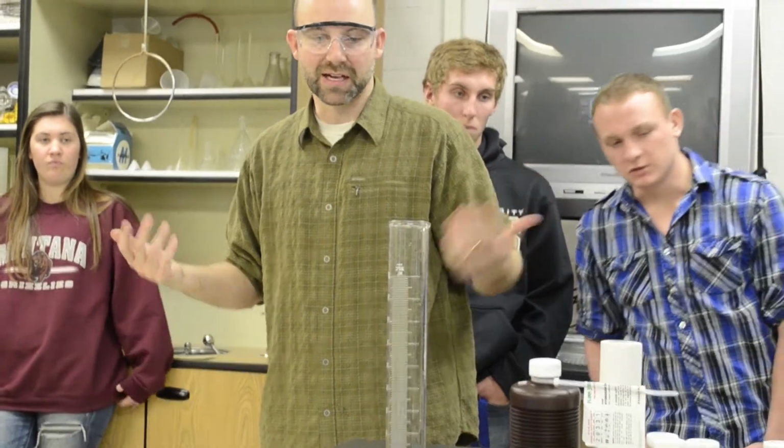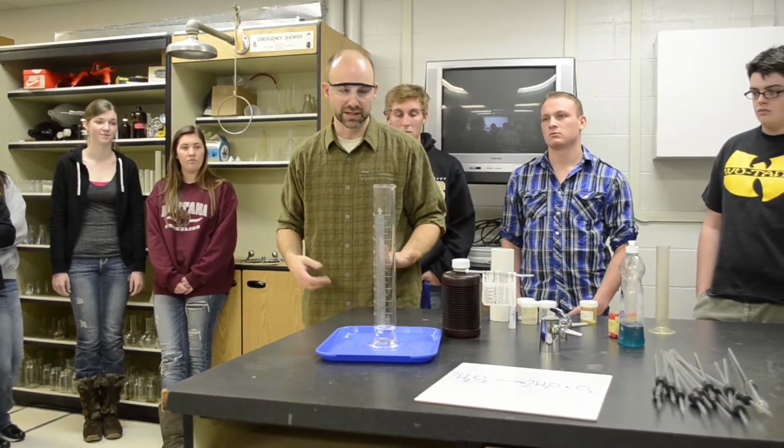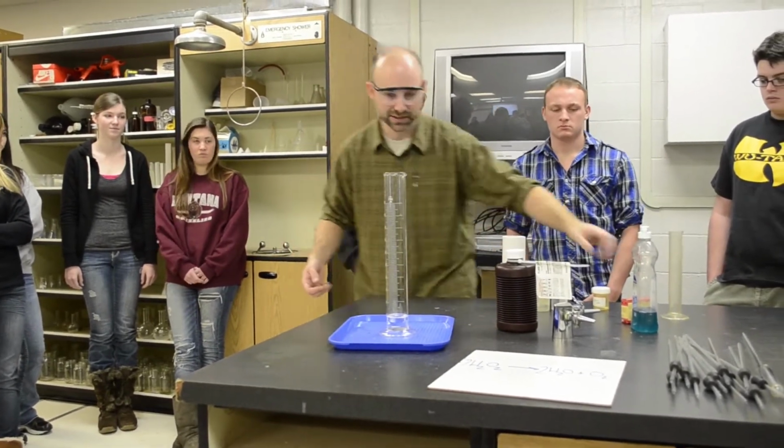So what we need to do is speed up this reaction. What could I do? Add a catalyst. I could add a catalyst, of course. I could heat this up. I could put this under a burner, and then all of a sudden you see bubbles and froth and everything. I could increase the concentration of the hydrogen peroxide. I could add a catalyst. Okay, so let's do that.